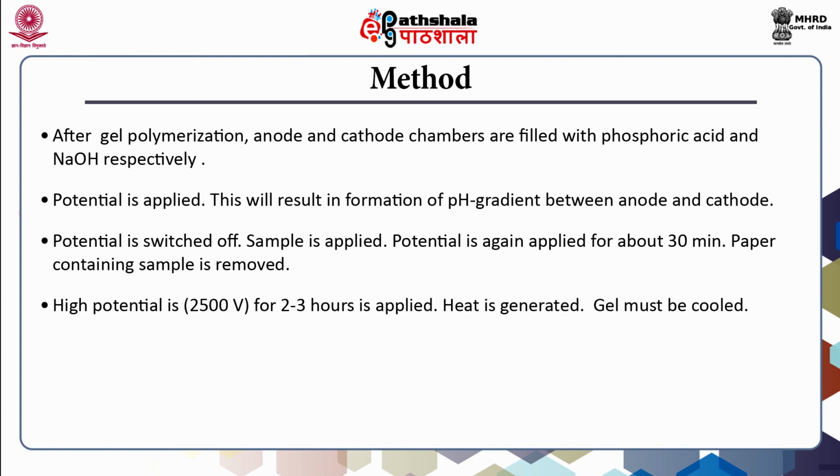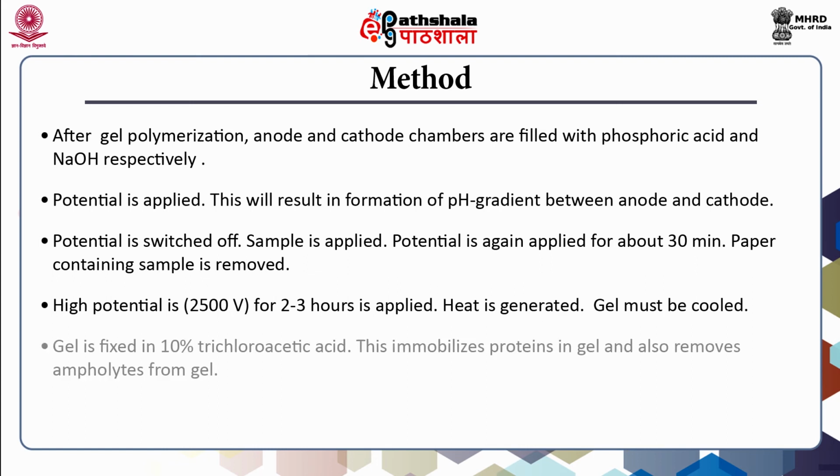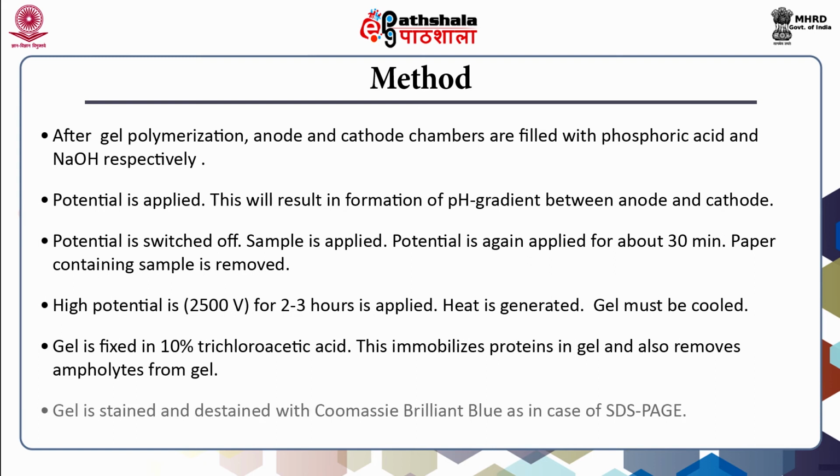When electrophoresis is completed, the gel is fixed in 10% trichloroacetic acid. This immobilizes the protein in the gel and also removes ampholytes from the gel. Presence of ampholytes in the gel results in background staining when the gel is stained with Coomassie blue. The gel is also destained, as in the case of SDS-PAGE.